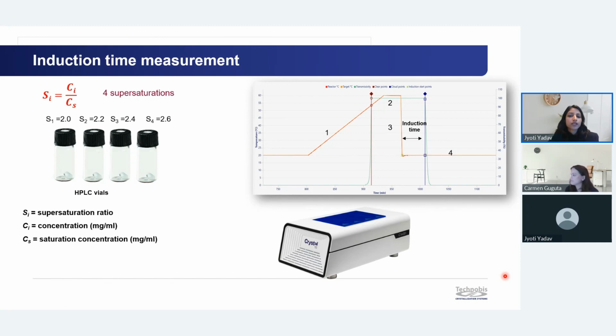So it will give you analysis for 80 experiments, or also at different supersaturations or at different solvent compositions, which you can also combine in multi-analysis and see their plots in the same graph. That's a good remark that I didn't think about. There are many compounds that easily decompose chemically, so you would still like to have a good data set of reliable data, and then you can combine it in this way.